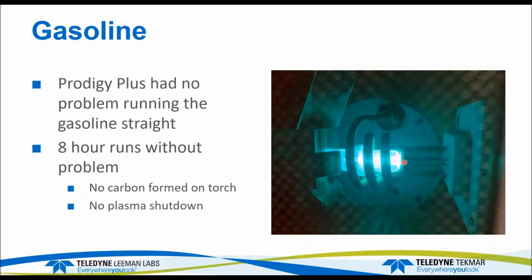So you can see there's not a lot of space between the end of the discharge and here. That's why I've got it set up for 2 liters a minute. You know, I'm really trying to push that forward. Sort of constrained on where the torch can be relative to the air knife, and that's for the halogens. The intensity changes quite a bit if the torch is further back, or the air knife is further away. So this was the setup that gave us the intensity, the sensitivity that we needed, but it was quite close. But again, we didn't get any buildup of carbon. And if we did get some, then we would have brought in the oxygen. We didn't need to do that.